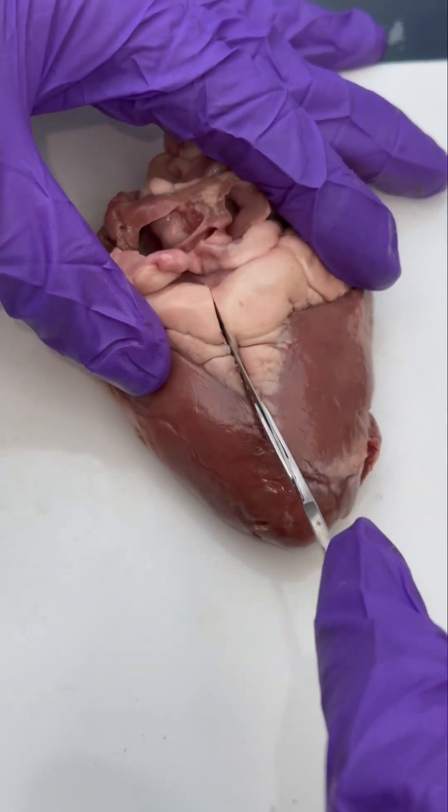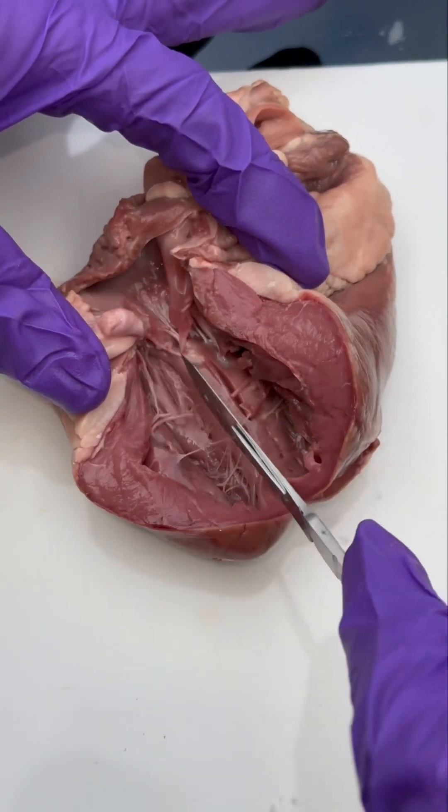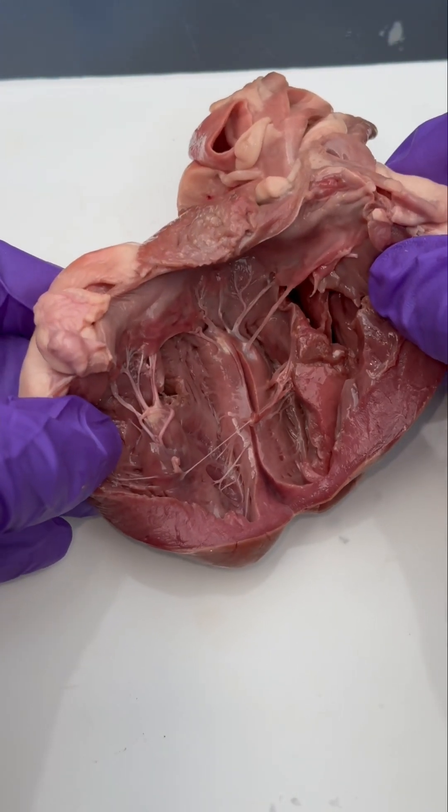Once the blood is oxygenated, it re-enters the heart via the pulmonary vein into the left atrium. The left atrium then contracts and sends the blood into the ventricles, and the ventricle contracts and then the blood goes through the aorta and gets distributed throughout the entire body.